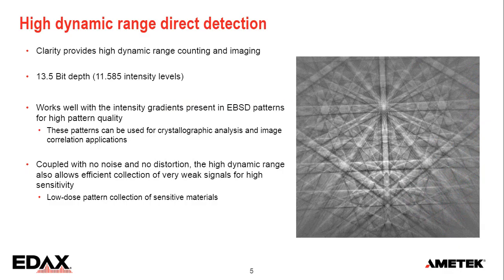The velocity camera has a few different imaging modes where, for the highest speeds, we use lower bit depth to allow for faster processing. The spec is up to 12-bit, so you can get a lot of intensity levels already.